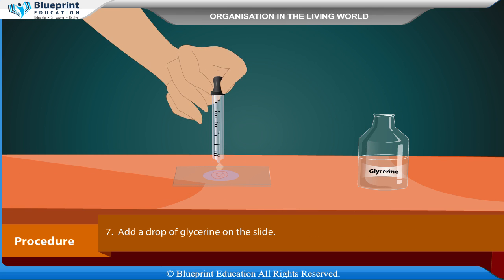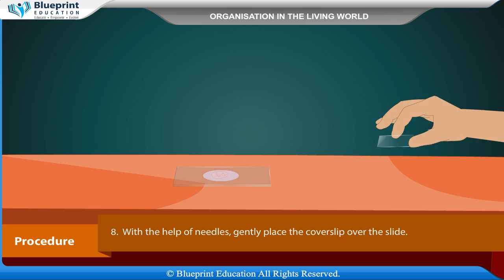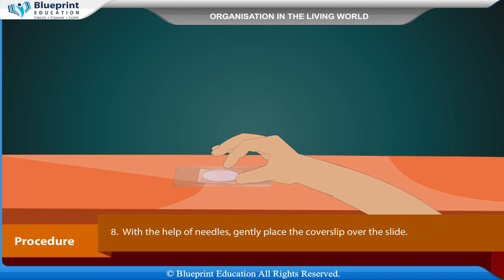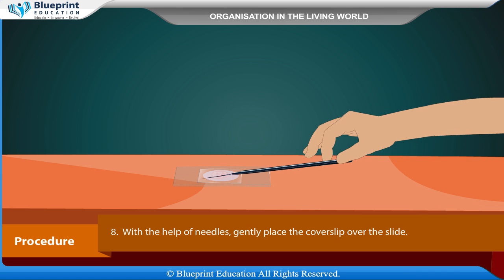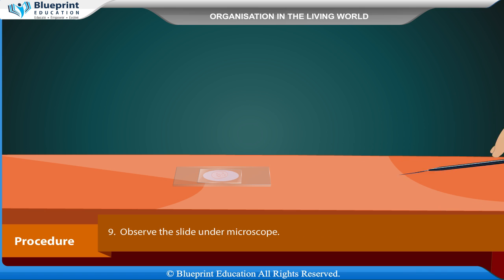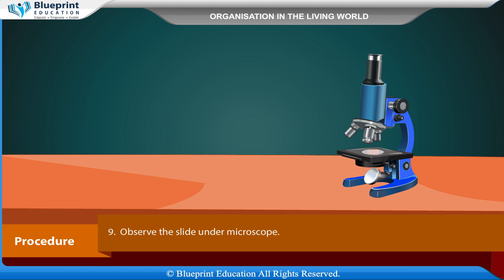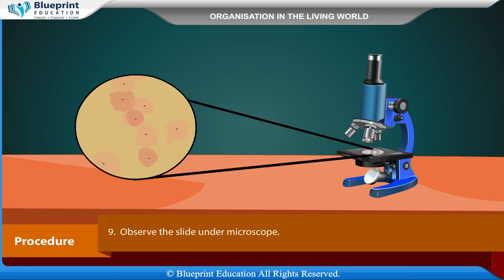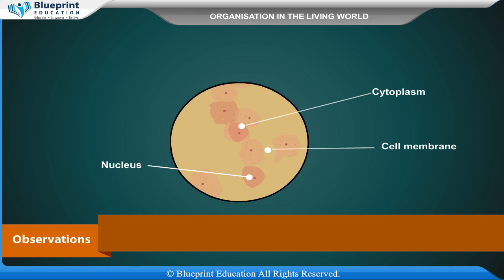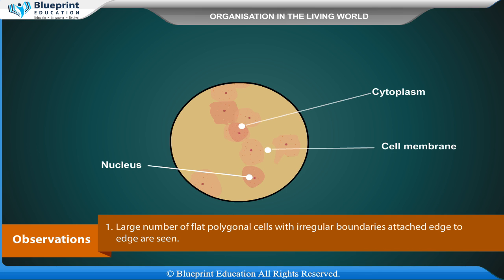Add a drop of glycerine on the slide. With the help of needles, gently place the cover slip over the slide. Observe the slide under the microscope. Observations: A large number of flat polygonal cells with irregular boundaries attached edge to edge are seen.